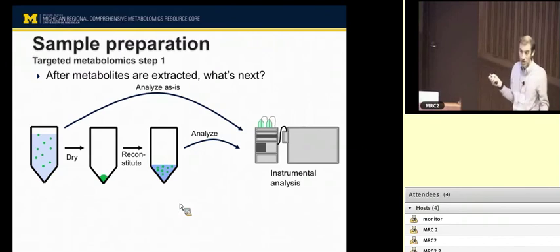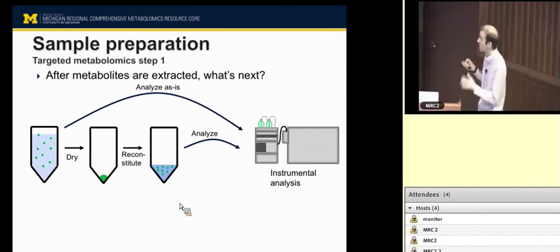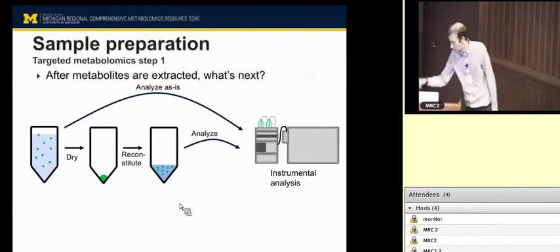Some of them you'll already know because they were already given to you in a table with identities. Some of them may be unidentified, and there may be more work required to figure out what they are. But that's the point where you really want to go and invest the effort in identifying the unknowns. And then you go and do further analysis, which will be a major subject.